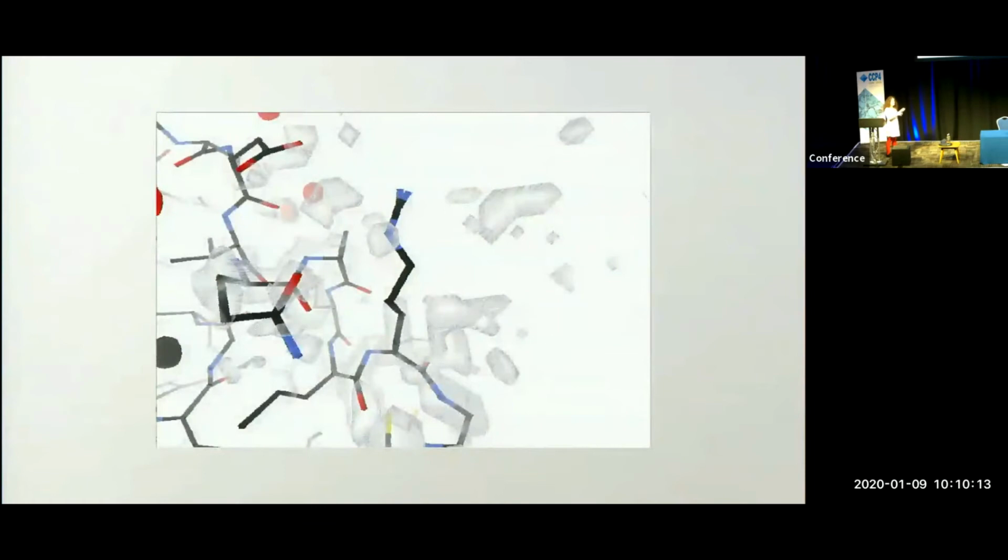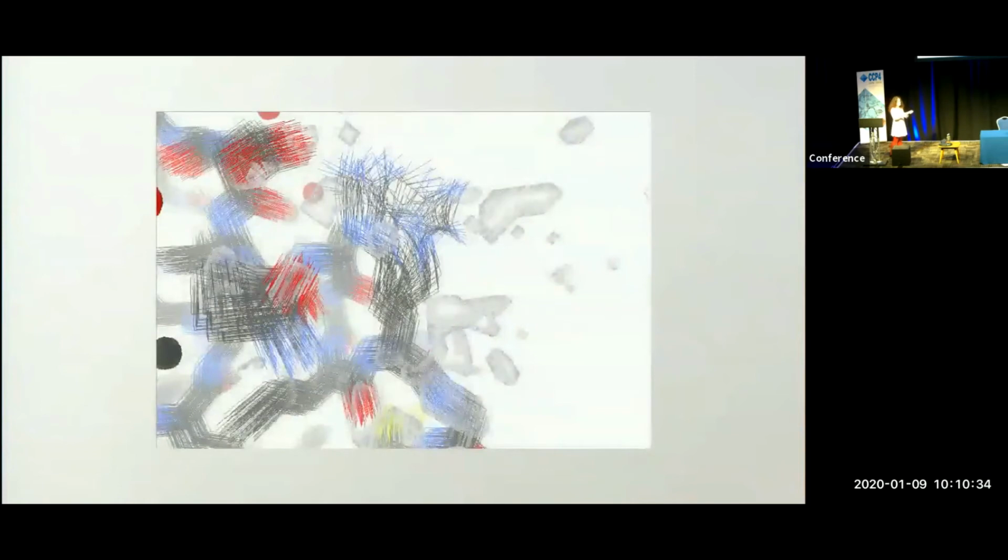So the result of this, if I show you the result, this is a screenshot from the Vagabond GUI. Here's an arginine sidechain which has been refined. And as you can see, the two nitrogen atoms look incredibly close together. They are actually that close together, and it looks ridiculous. But this is actually the average atom position. And this arginine actually represents a set of 120 different arginine conformations, each of which does have perfect bond length and angle geometry. And as you can see, this is a perfectly valid scenario, but the average position does look very weird.